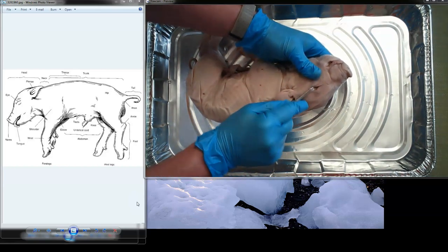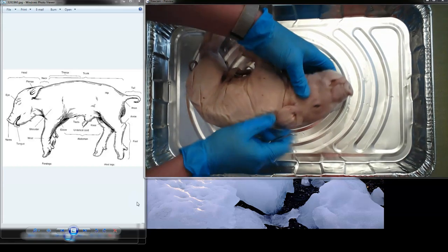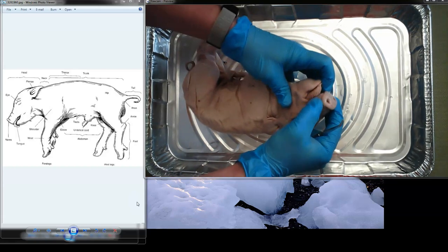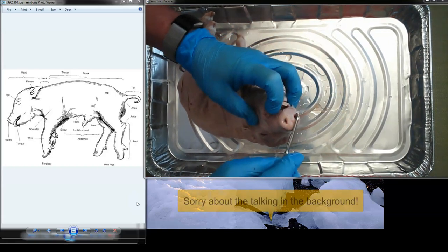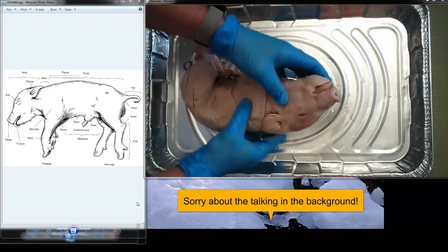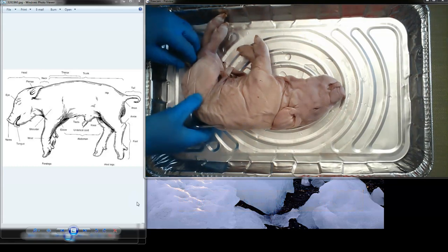All right, we can see inside. It has a little membrane on top of it. And then in the mouth, which we're going to cut open, it has a tongue. You see two nostrils. There's the chin over there, and these are obviously parts that you would already recognize.